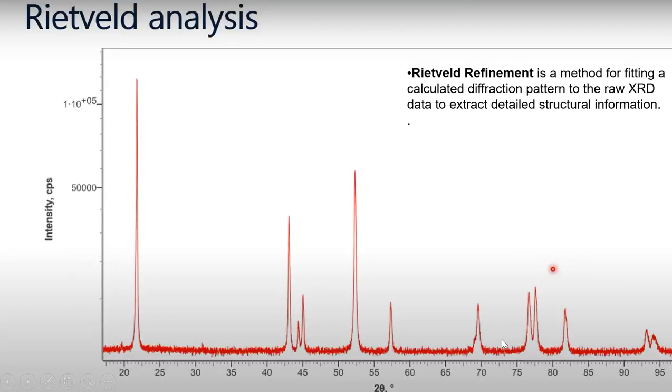So the another application is the Rietveld analysis. The Rietveld refinement is the method for fitting a calculated diffraction pattern to the raw XRD data to extract the detailed structure information.